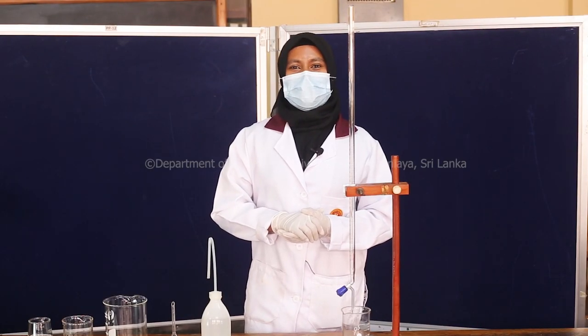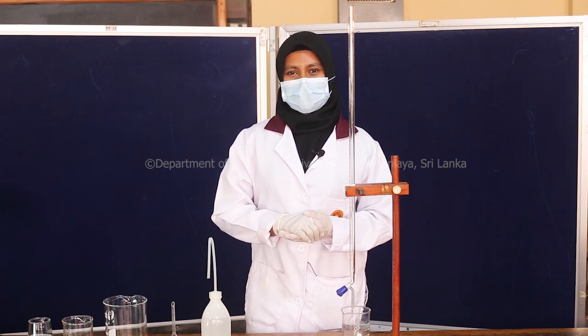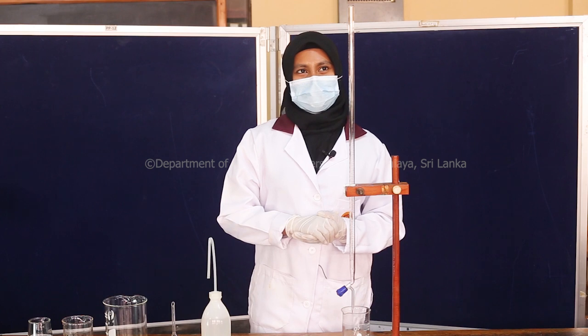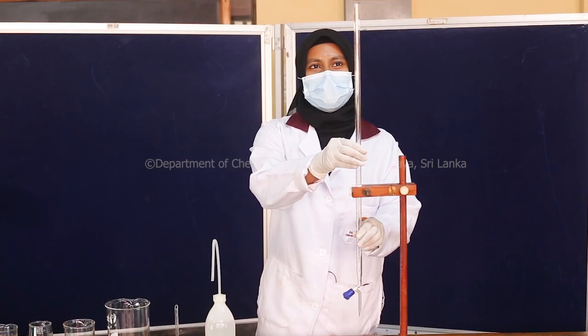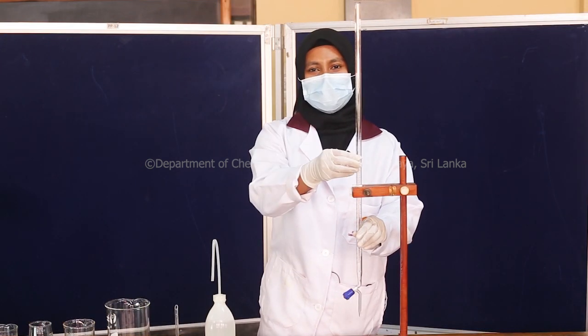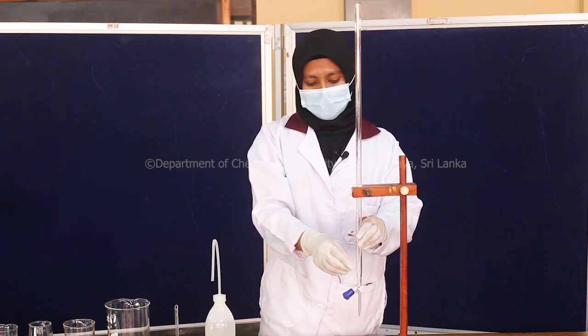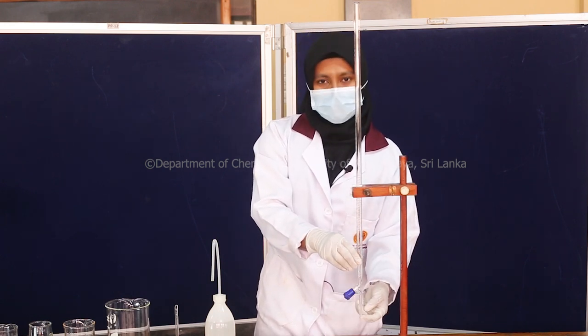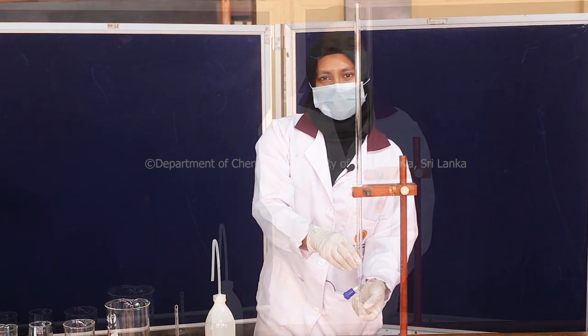In this video, we are going to show you how to handle a burette. First, let us identify the parts of a burette. So this is the burette and this is the body of the burette with the calibration of 0 to 50 milliliters. And this is the tap of the burette and this is the tip which is located at the bottom.